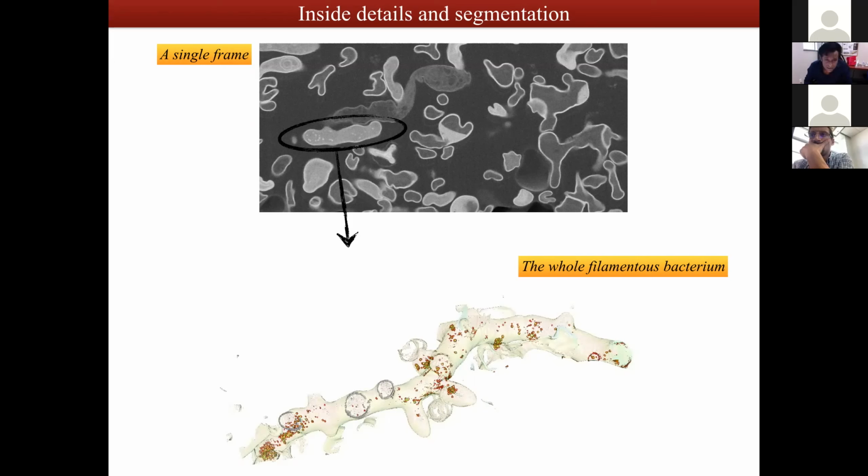So Daniel says this cryo-negative staining would be similar to negative staining for the TEM. No, Daniel, there is a bit of a difference. In regular negative staining for TEM, we let the sample sit and dry. What we do here is that just before plunging the sample, blotted, into liquid ethane, we put the staining solution, which is ammonium molybdate, say in this case, mixed with the sample on the grid.